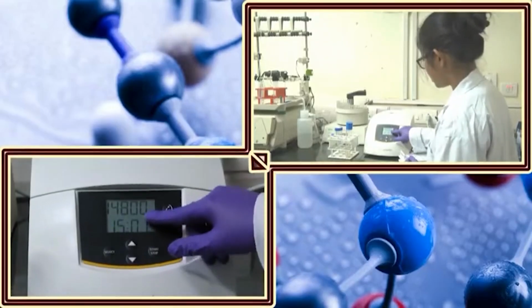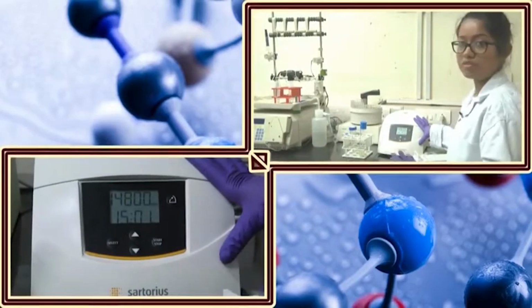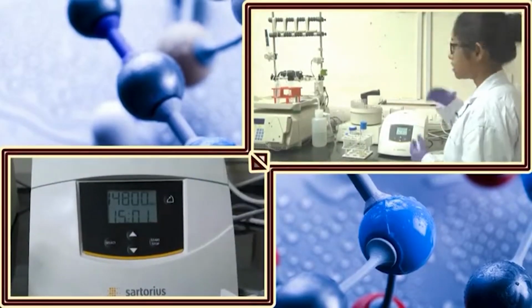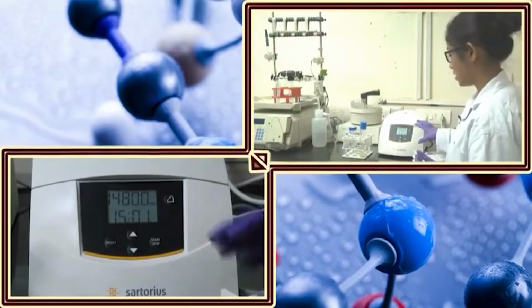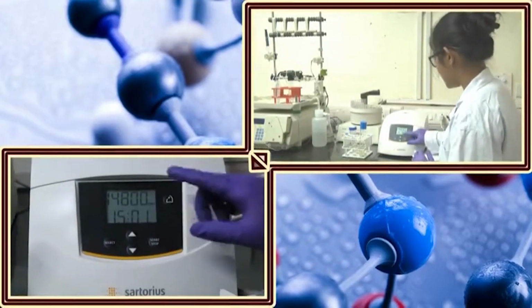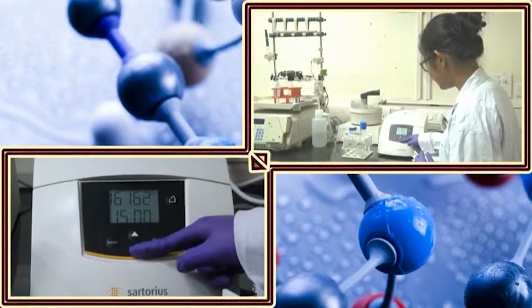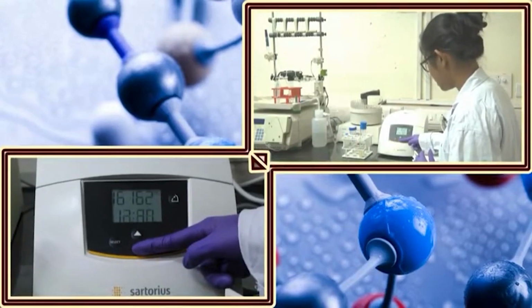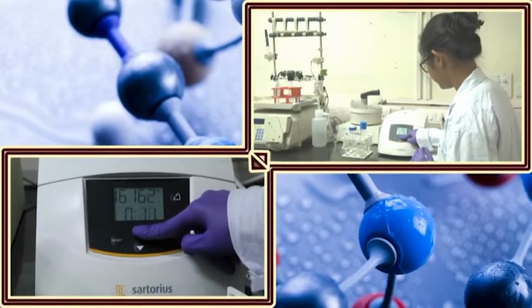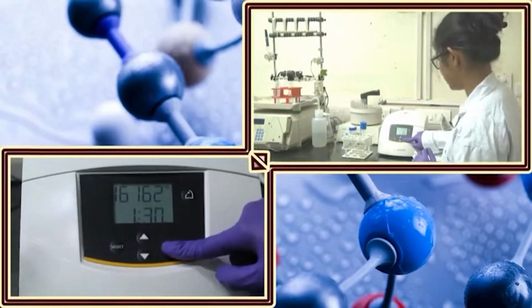In the centrifuge there is a setting for RPM as well as the time. So in this centrifuge there is no parameter called temperature. Other centrifuges also have a temperature probe, but as during plasmid isolation we do not really need the temperature, it happens at normal room temperature, which is around 25 degrees centigrade. So we do not need a temperature sensitive centrifuge machine. It only requires the time and the RPM or RCF. Here we will reduce the time to around 1 minute or 1.5 minutes, until there is pellet formation. And then we will start.